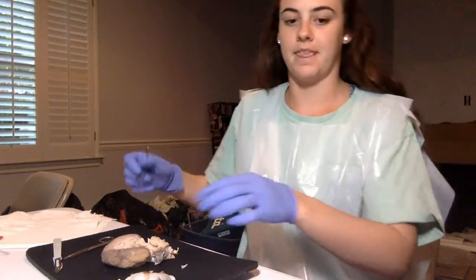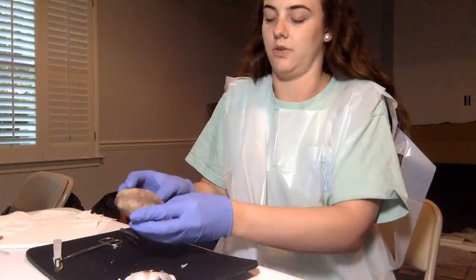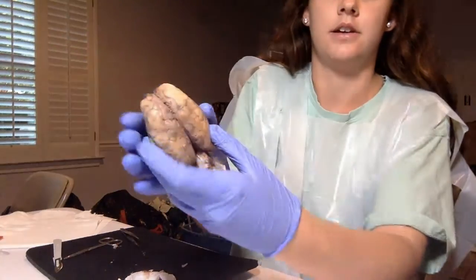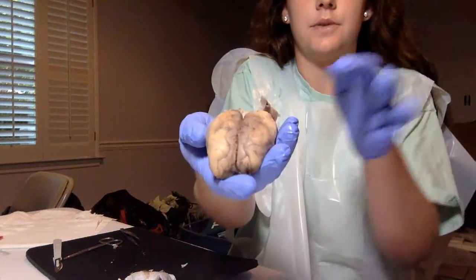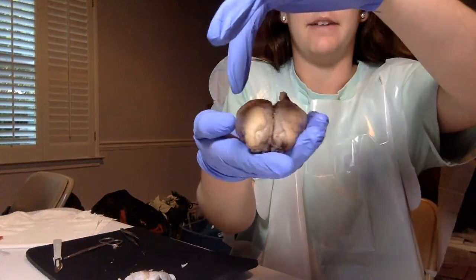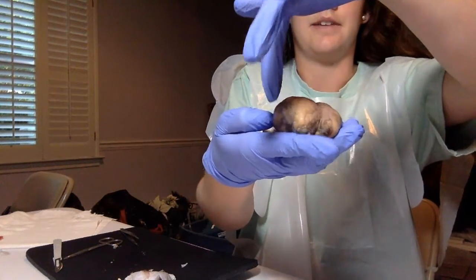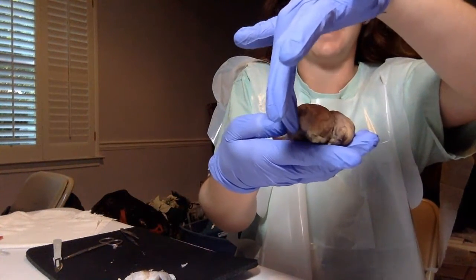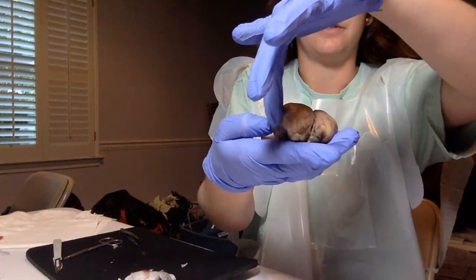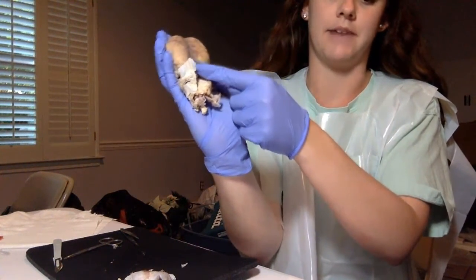First I will start by pointing out the different lobes on the sheep brain. First we have the frontal lobe in the front, and then we have the parietal lobes, which are on the side. Then we have the temporal lobes, which are also on the side and a little lower and closer to the front. And the occipital lobe, which is in the back of the brain.